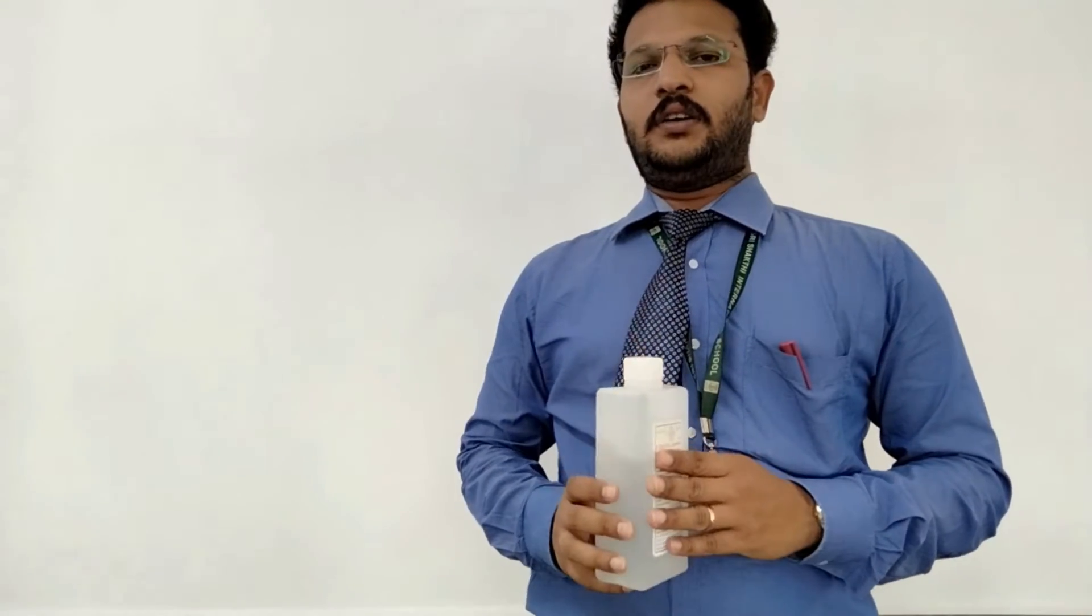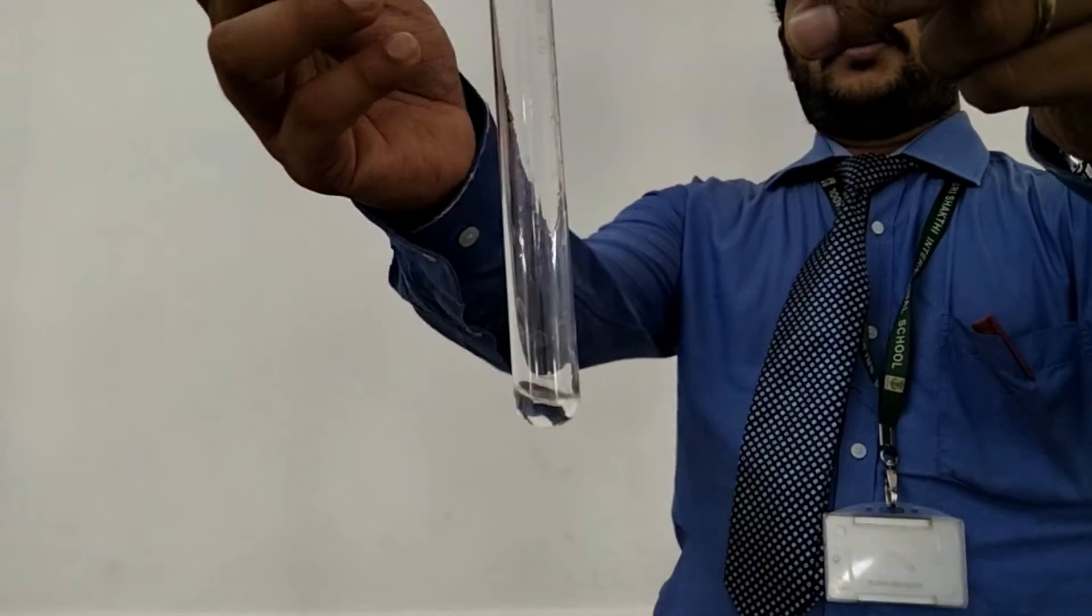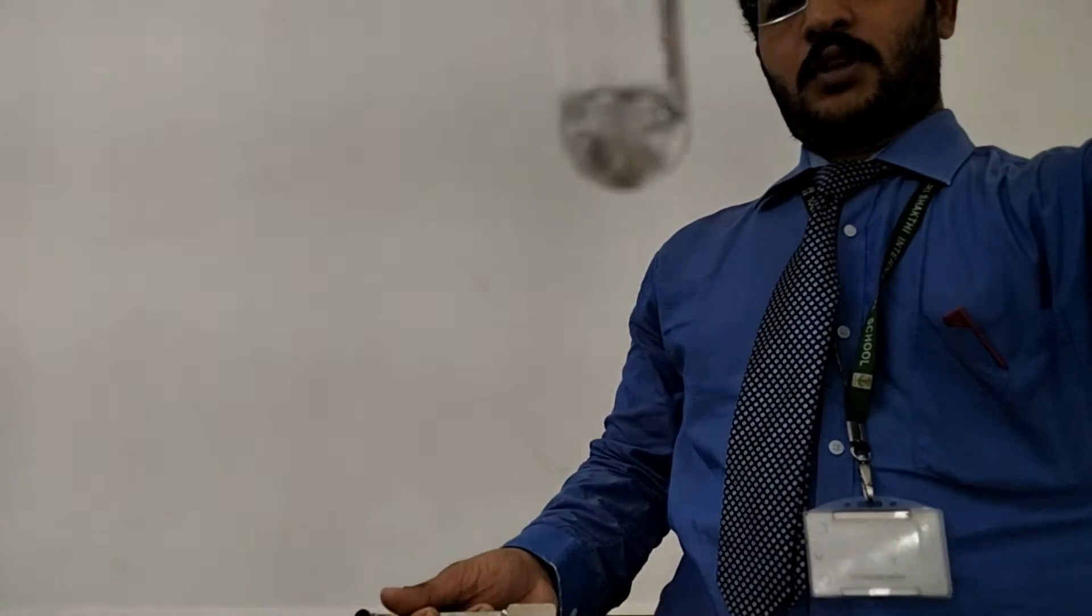Now I am going to take this vessel off and we are going to check the experiments which confirm the alcoholic groups. Adding a few drops of ethanol and adding sodium metal, you can find the brisk effervescence is coming out.